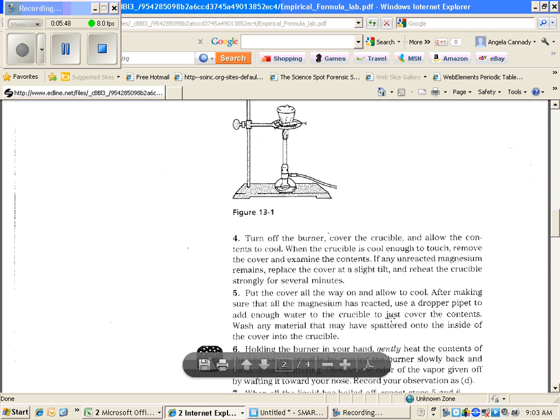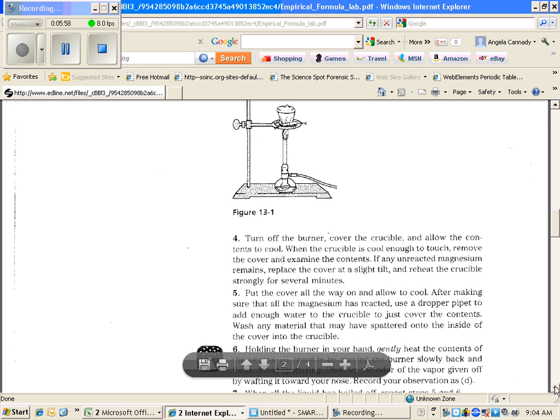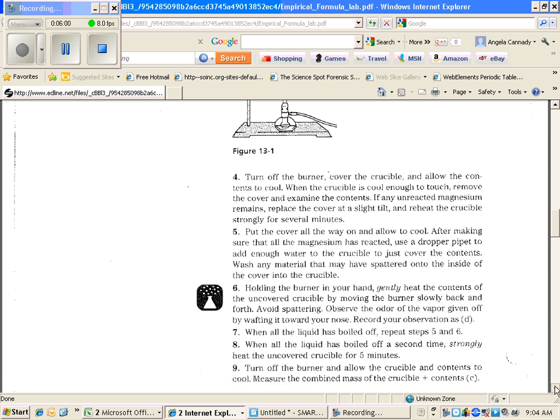Use a dropper and you're going to add water to just cover the contents. You don't want it drowning. You want it to just cover the contents. And you're going to basically wash down the sides of the crucible. After you do that, hold the burner in your hand.